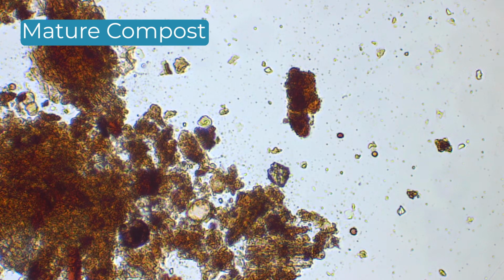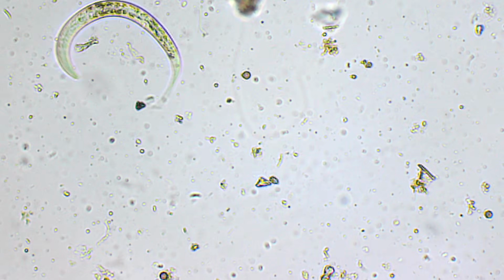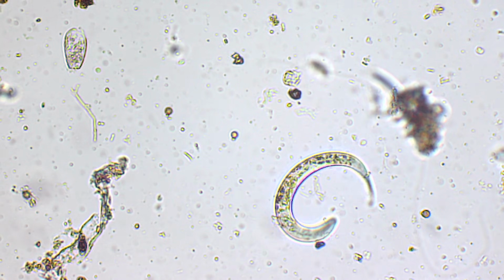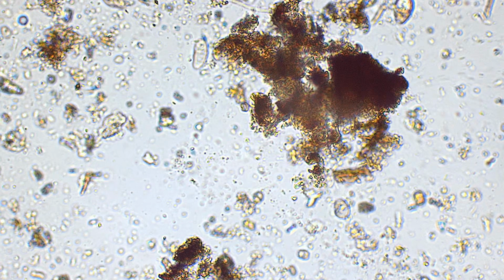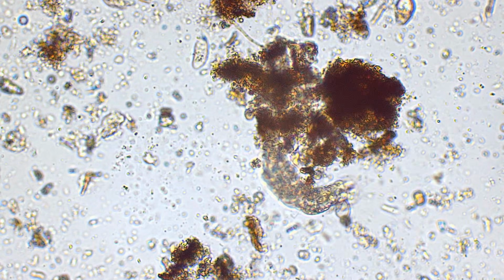Mature compost. Mature compost is typically less microbially dense than active compost, but has more fungi and more omnivore feeding nematodes. Mature compost samples have greater biodiversity and a higher fungi to bacteria ratio. This sample demonstrates a more stable microbial community with good organic matter complexes. In more high moisture samples, you may even see an aquatic living organism like a rotifer.